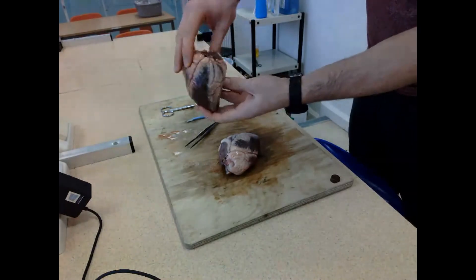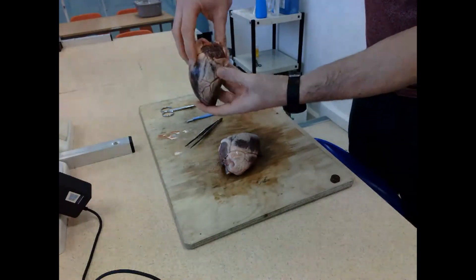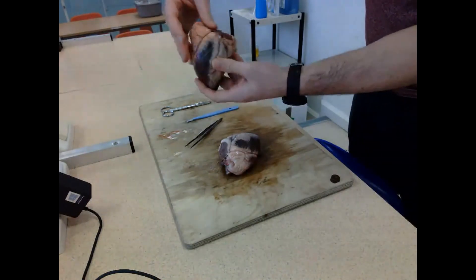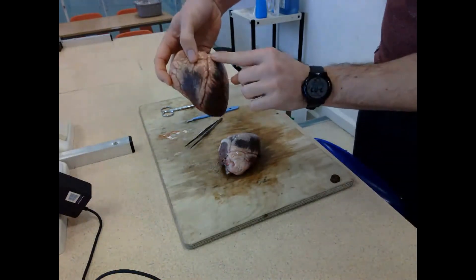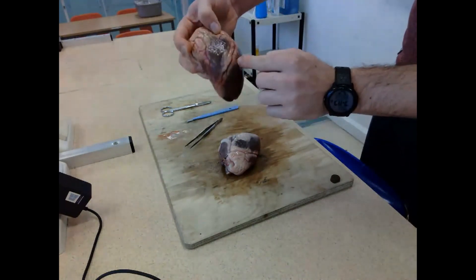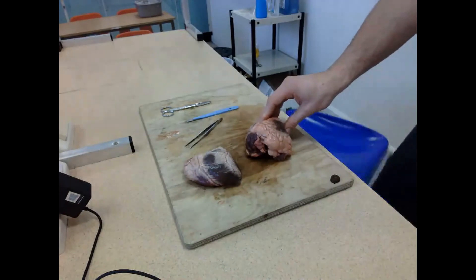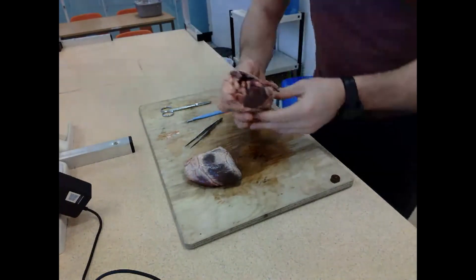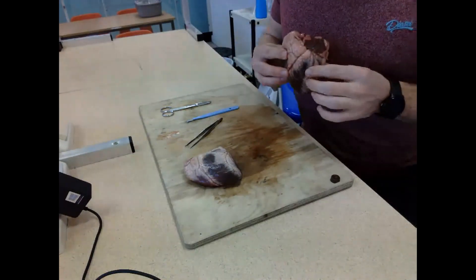I'm pointing out the back of the heart because it's really flat - it's called the dorsal side - whereas the ventral side is very curved. You can also quite clearly see the coronary artery running across the surface of the ventral side, which will branch off and supply the heart with blood, oxygen, glucose, and other nutrients.